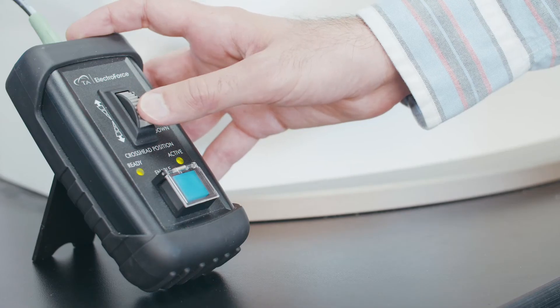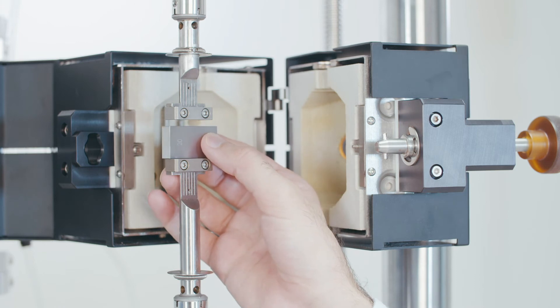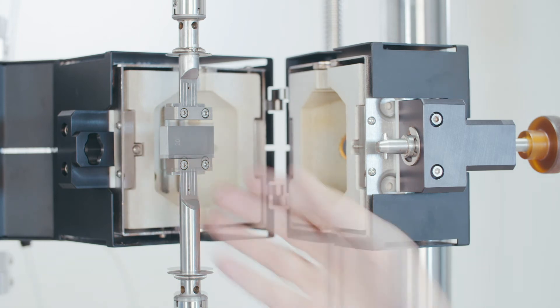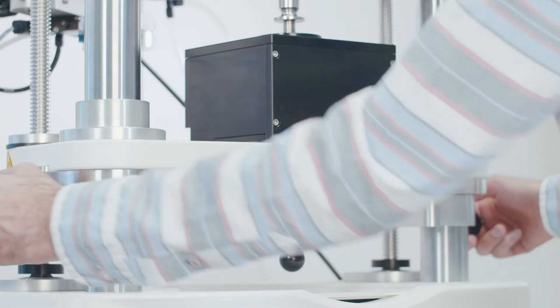With the power off, bring the lower grip down using the lift. Put the standard block on the lower grip. Move the lower grip up until the top of the gauge block is very close to the upper grip but not touching it. Lock the column clamps.